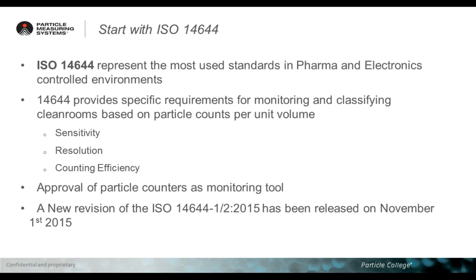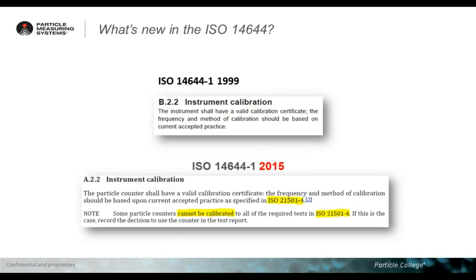The reason why I want to mention this standard is because in the recent update of this standard in 2015, the ISO committee emphasized the needs and requirements of particle counter calibration.